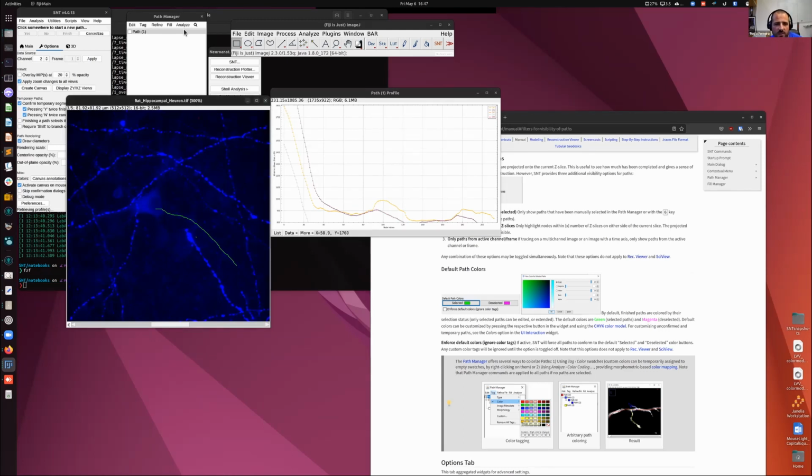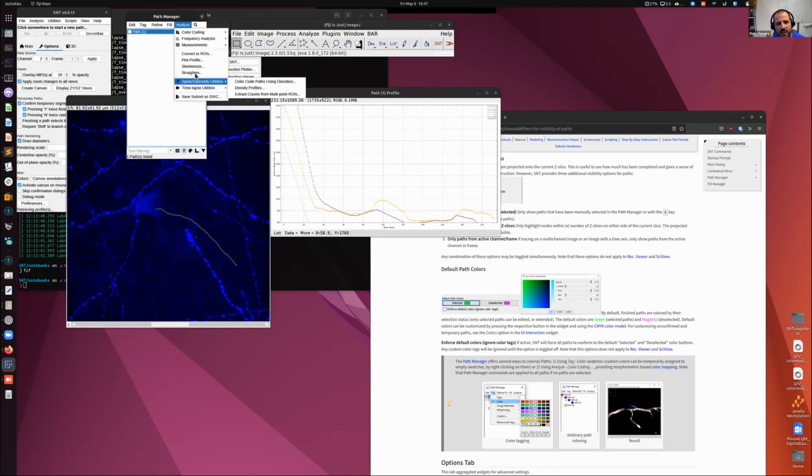Okay, so that's it. You have options for time lapse. You have options for skeletonize. You can convert the images into topographic skeletons, in which these are going to be binarized images. That's useful. It has all sorts of utilities. But you can also straighten the path. For instance, that path that we traced, we can pick a neighborhood of, let's say, 100 pixels. I guess that would work.